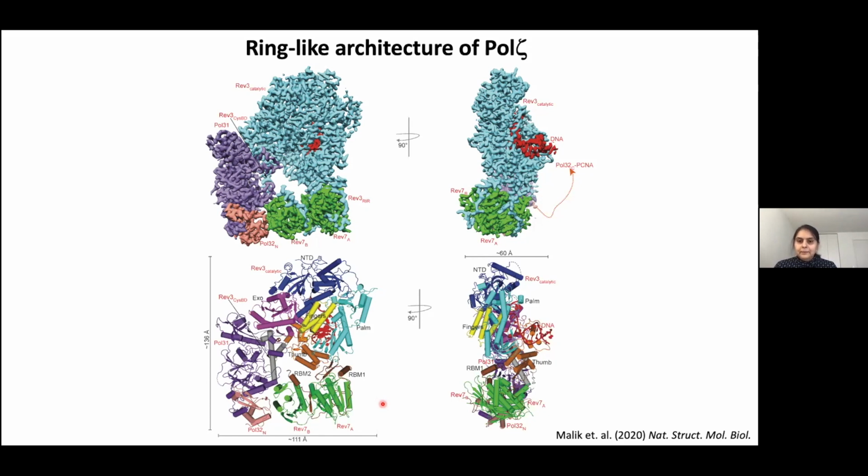Okay. We have a question where I'm going to reveal my ignorance of experimental cryo-EM. Do you measure the ice thickness for your grid? Yeah, we do measure the ice thickness while we collect our data. We use Leginon for data collection, and ice thickness calculations are incorporated during data collection for every image that we collect. Thank you. That runs through all the questions I've seen so far.